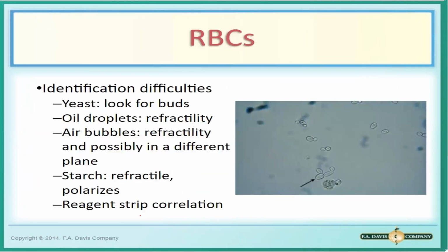First we have cellular constituents. We have RBC. We can see different shapes ni RBC, depende po sa type of urine. If your urine is hypertonic, it is crenated or shrunken. And then kapag hypotonic naman, it is ghost cells or swollen ang itsura.